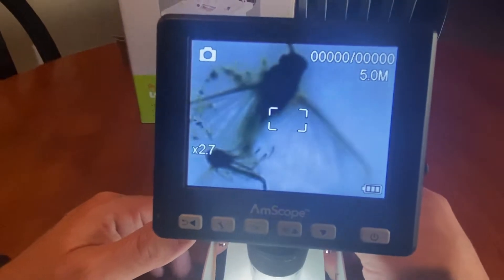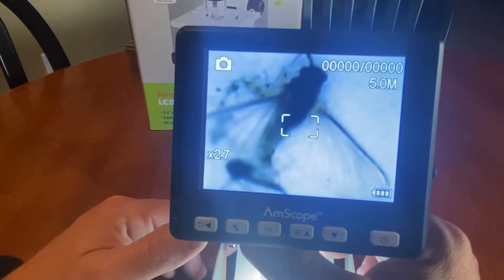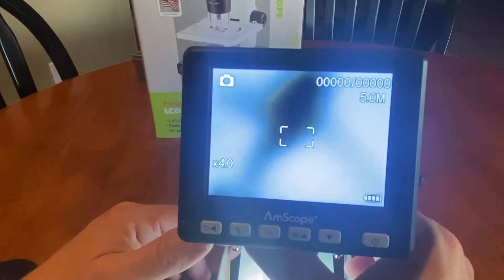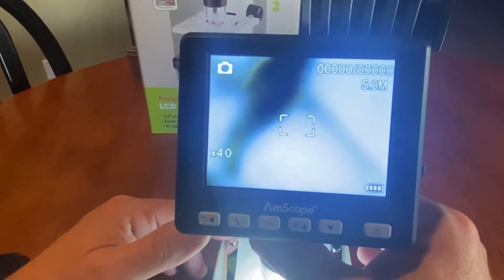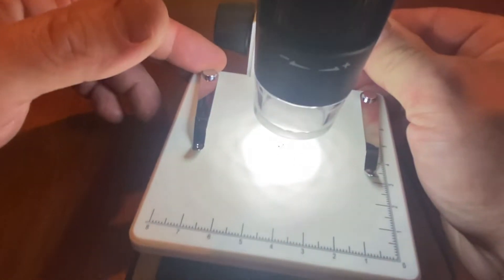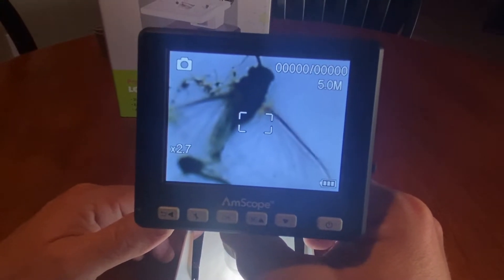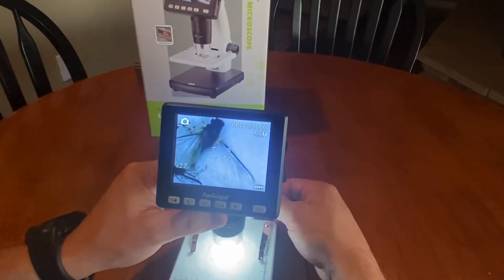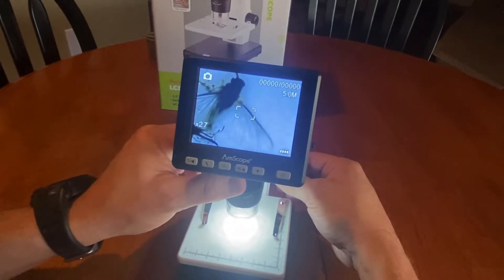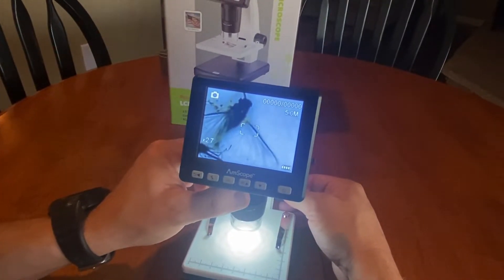Oh, that is cool. There are so many different options here to look at this thing. Focus on it — I mean, that's pretty close. I can get on those wings. This is just me messing with it a few times, so the more I learn the better I'll get and probably be able to see all the eyes on this thing. One day. Learning how to focus and adjust the sharpness on the display — but that's still pretty cool.